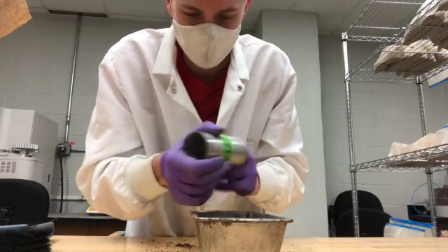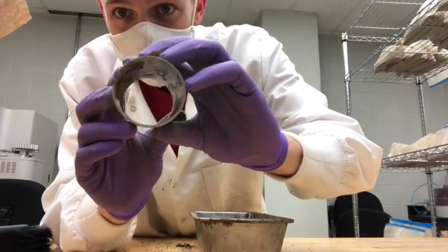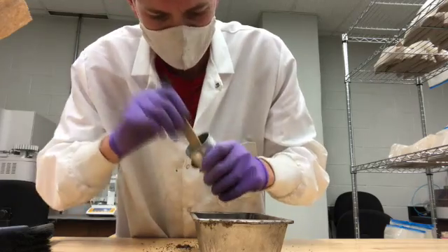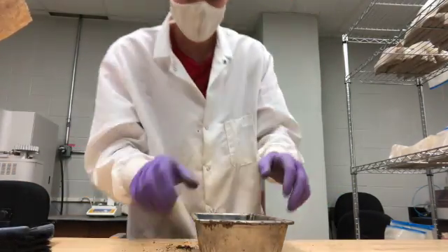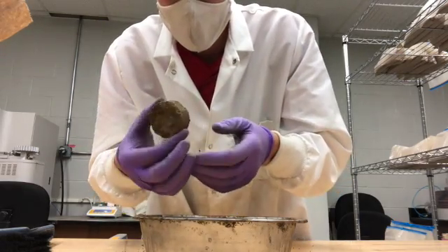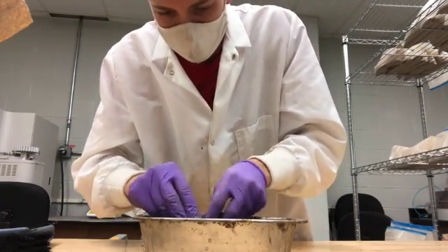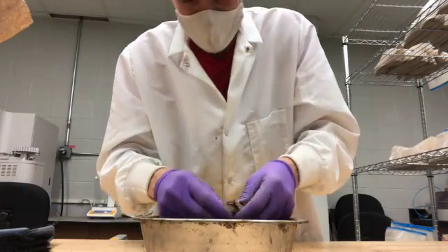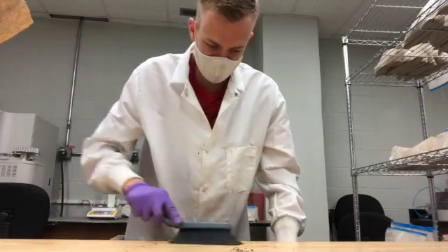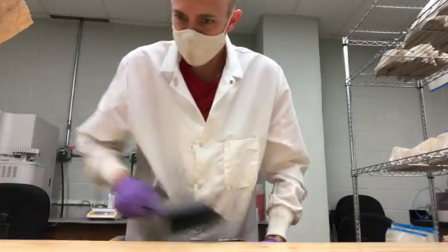I'm gonna get the residues out of here because every gram counts when it comes to bulk density. Whatever you cut out of that piece of soil, you want to get all of it out. There's still some residues in there, so I just have to brush those out. If you want it to dry faster, you can break up these little pieces — so there's a beautiful little piece of soil, all broken apart. I made a big mess, so I've got to sweep and brush everything back in because every little piece of soil counts.